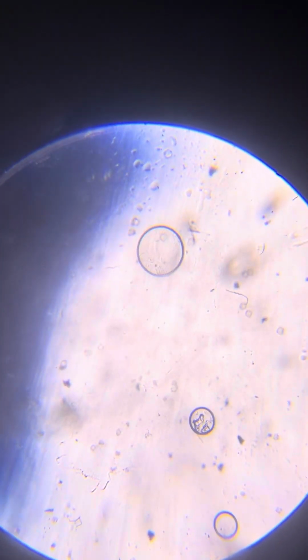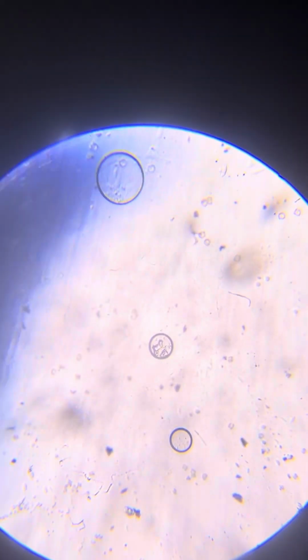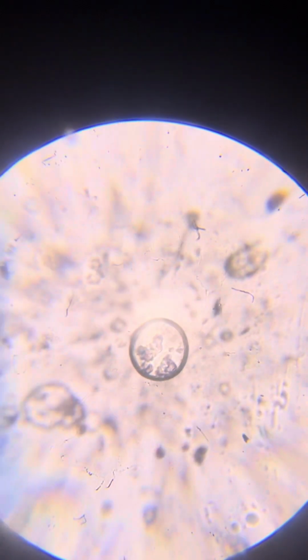Very nice. So definitely there are Neros in this ancient oil that was kept sealed from air for a year. This one is even in the Stargate position, which is nice.